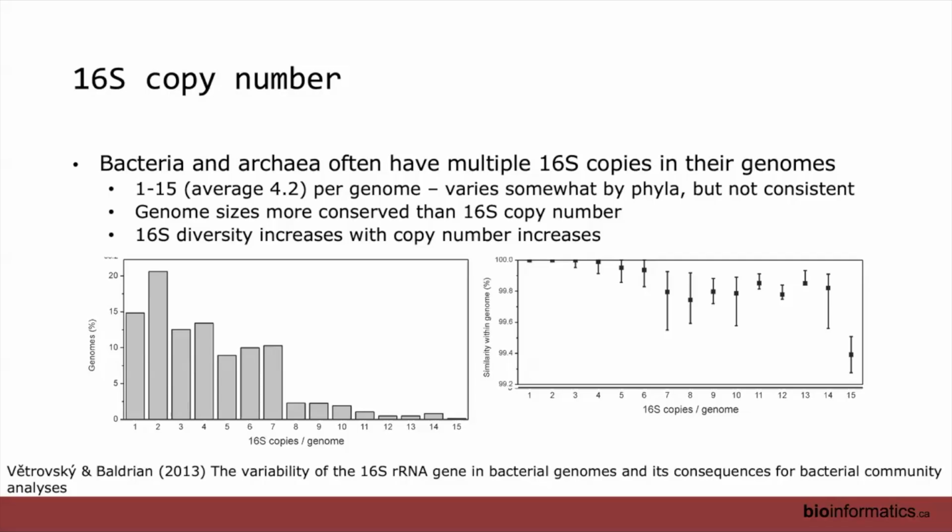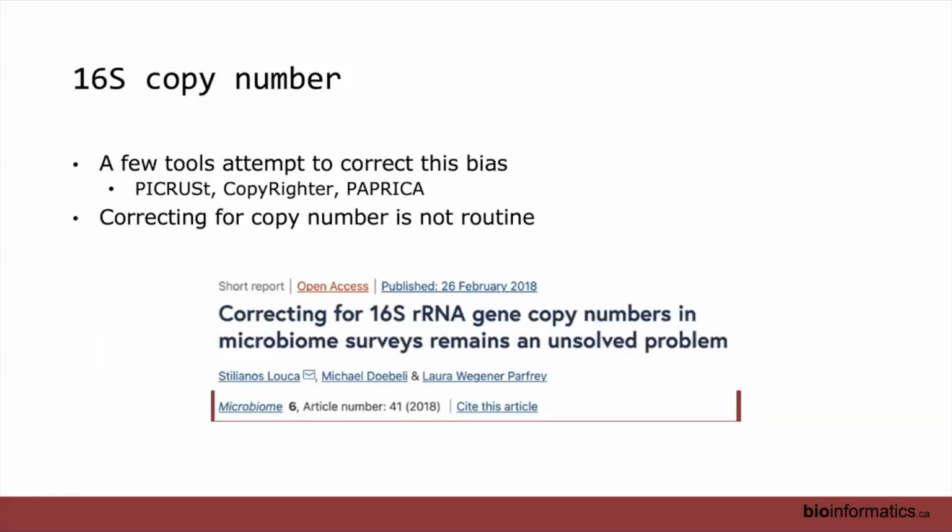Is that data in databases, so that post-analysis takes this into account? Typically not, no. I think just because it's so difficult to control for. There are a few tools that try and do this. Even PICRUSt, which Morgan developed and I've done some work on as well, does aim to do this, but it's not straightforward enough that it's routinely done.